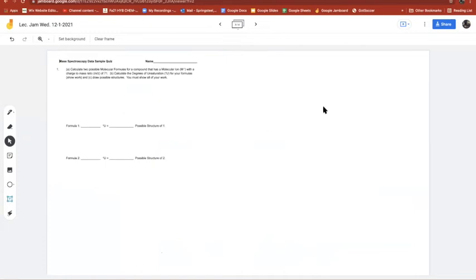All right, first off, I'm asking about a molecule with a molecular ion of 71. That's odd. 71's odd, right? So what should we do about that 71? What's that telling us?